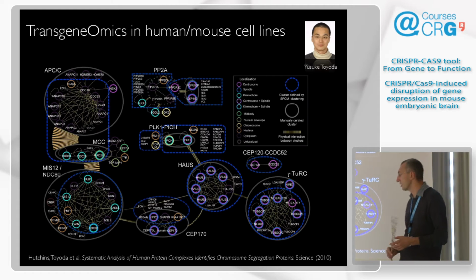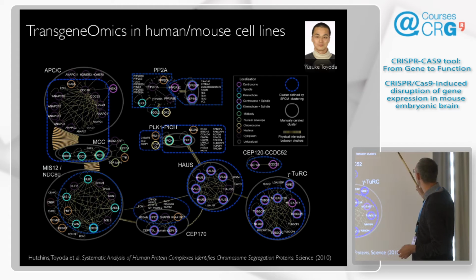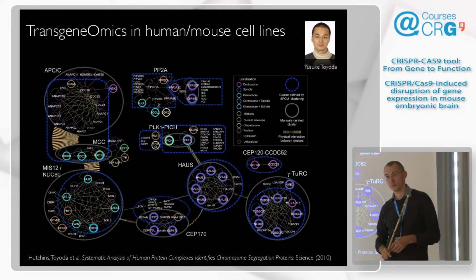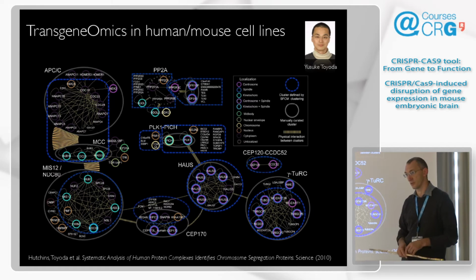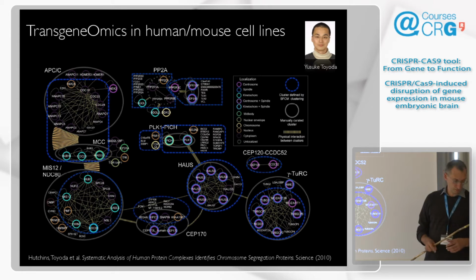And this is just one figure from a paper which focused on the mitotic organization, so on the proteins that have a function in mitosis. And they were studied from 2 different directions. Resolution is poor, but the interrupted ones are from localization, co-localization, and the solid ones are from IP. So IPs were done for all the proteins, and localization was done for all the proteins dynamically through the entire course of mitosis. And basically, this is a summary of the entire process.